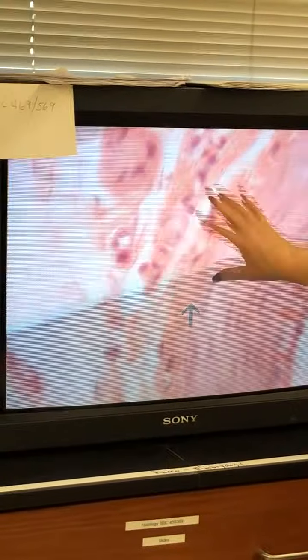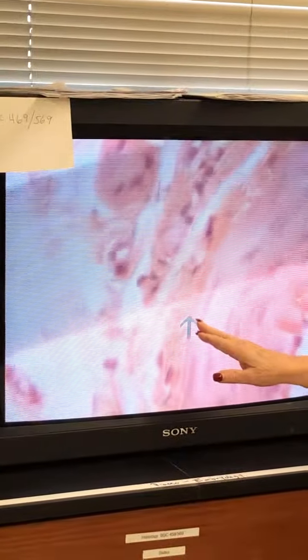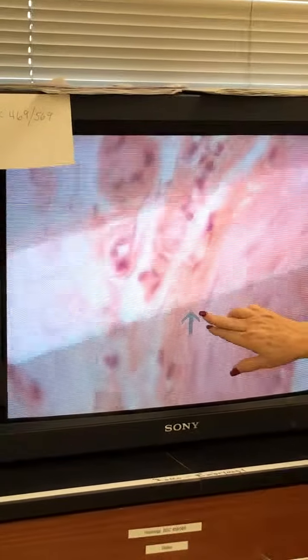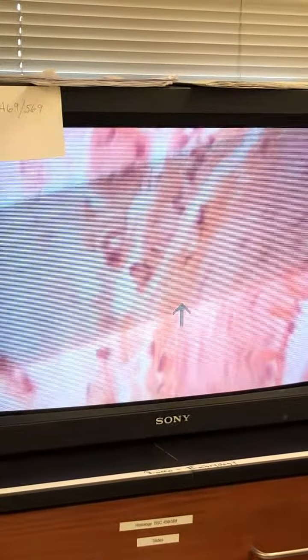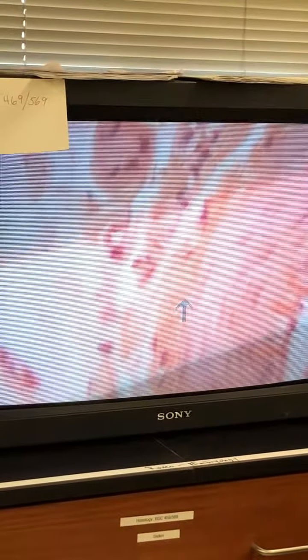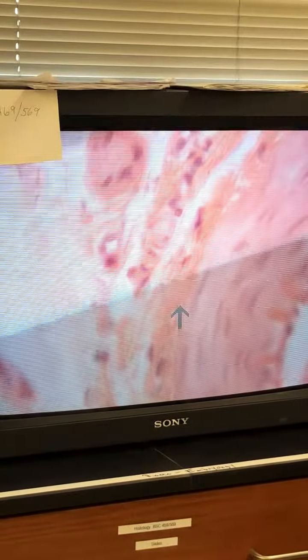Then I'd say, name the general layer on the left, the tunica adventitia, and the one on the right, the tunica media. That way you would know what I was talking about. Even if you thought that's part of the tunica adventitia, if I'm calling it a structure and not a specific layer, then you know. So I can give y'all those types of clues.